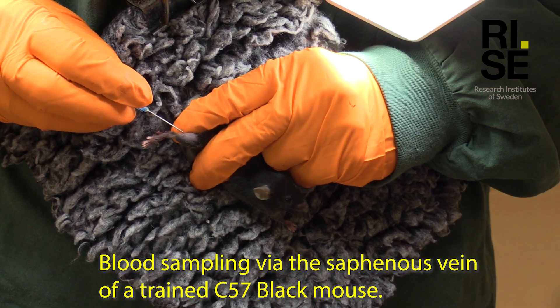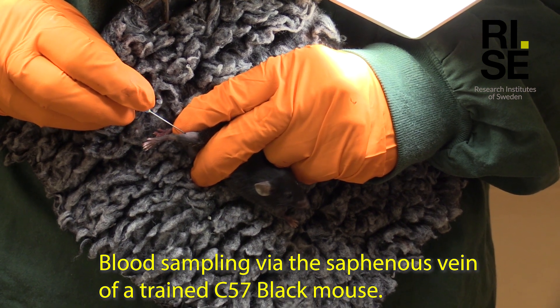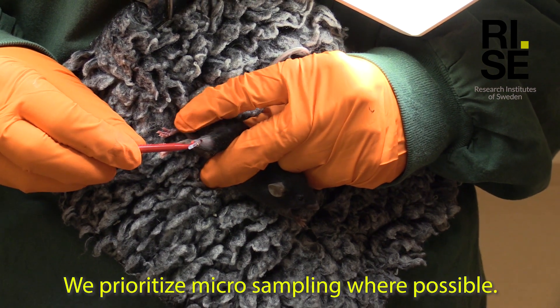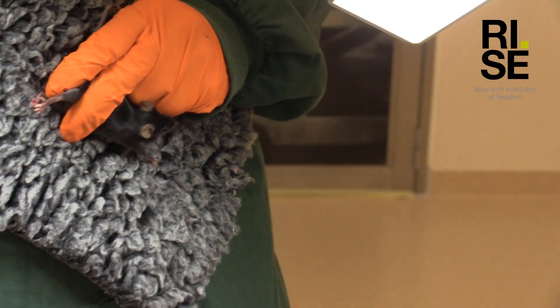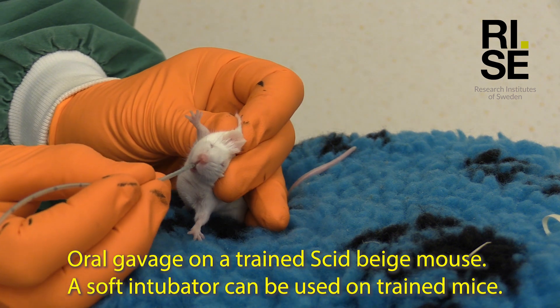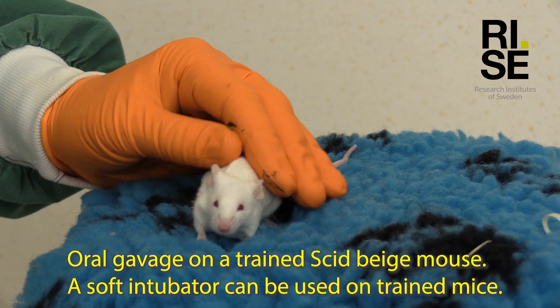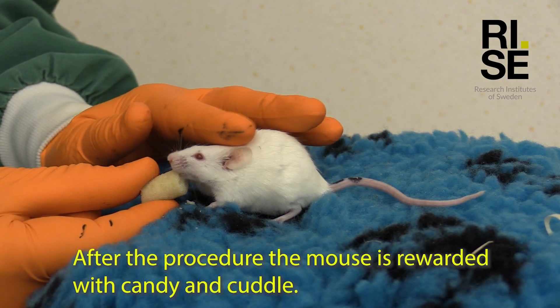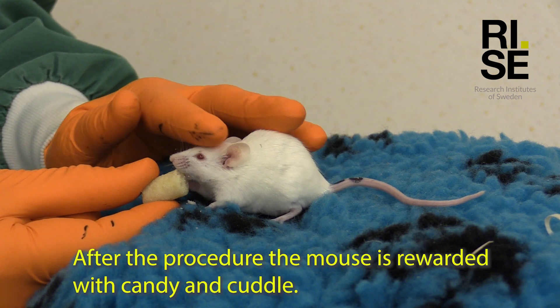Blood sampling via the saphenous vein of a trained C57 black mouse. We prioritise micro sampling where possible. Oral gavage on a trained Skid beige mouse. A soft intubator can be used on a trained mouse. After the procedure the mouse is rewarded with candy and a cuddle.